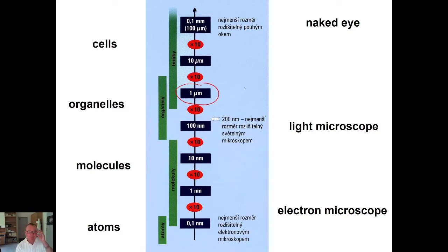There are some exceptional bacterial cells which have this size, but all human cells are bigger than 1 micrometer, and it can also allow us to see some organelles which are bigger than 200 nanometers, like mitochondria, some lysosomes or granules. They are not organelles but inclusions. Nevertheless, they also belong to the group of structures visible by light microscope.